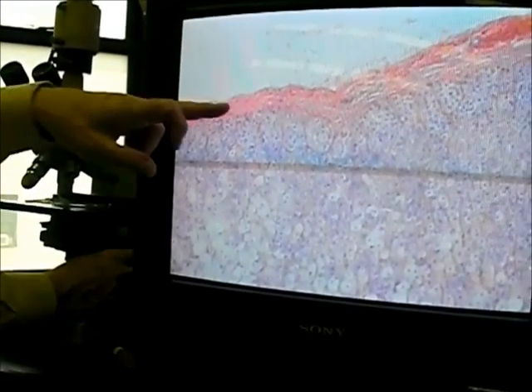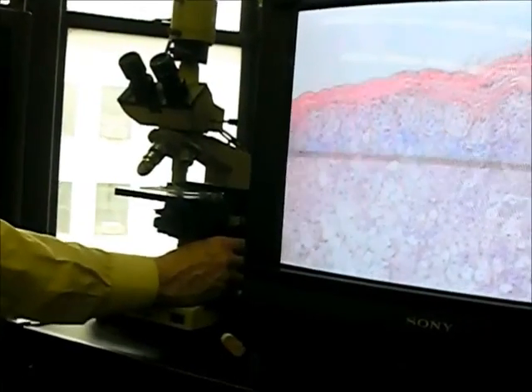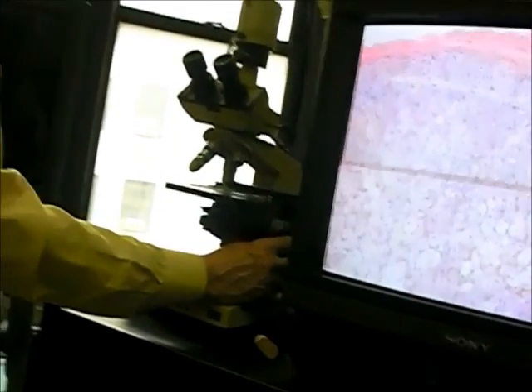This is the surface of the adrenal gland. This is the zone that makes aldosterone. This is the zona fasciculata. You see lots of these parallel capillaries. You don't have to remember the zones, but they're all part of the adrenal cortex. So what type of hormones does the adrenal cortex make?